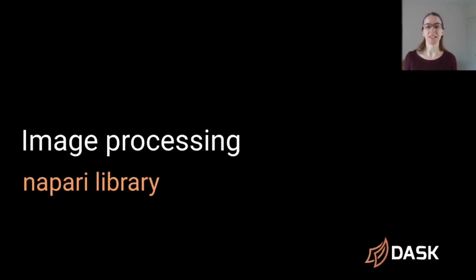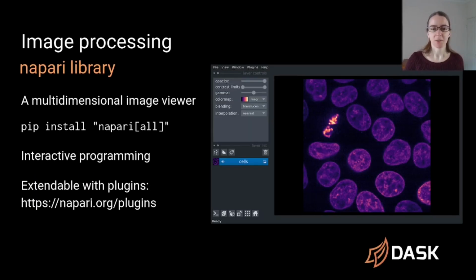Napari is a multi-dimensional image viewer. You can see a screenshot on the right here of the main Napari interface. There's the main viewing area, which in this example has a picture of some fluorescent cell nuclei. But Napari isn't a standalone image viewer.